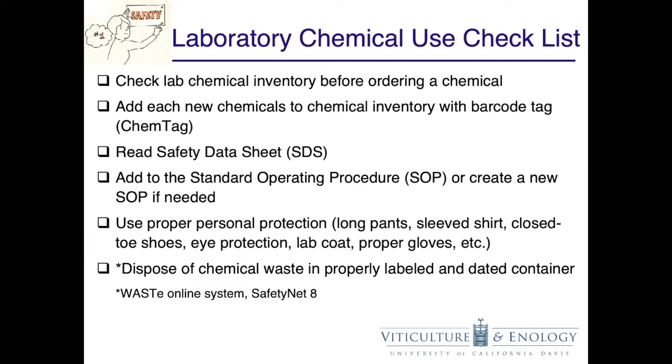Safety Net 8 details guidelines of proper waste disposal. All chemicals and solutions, including water, must contain a label with a full chemical name and date and must be stored properly.